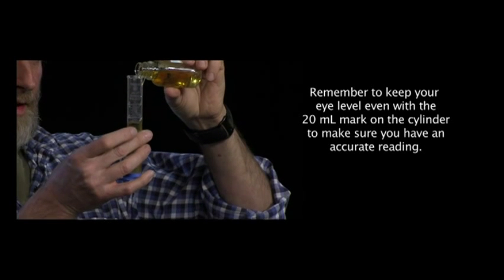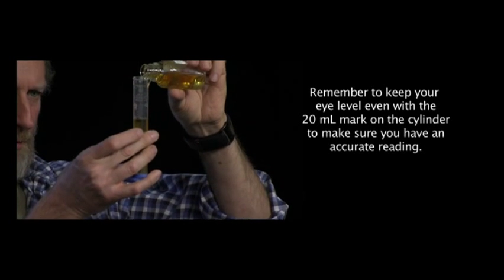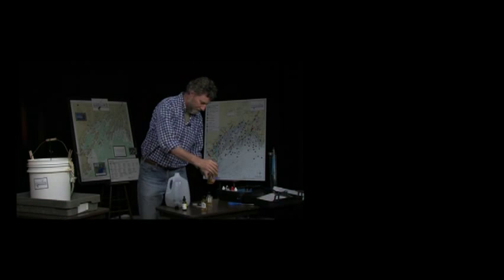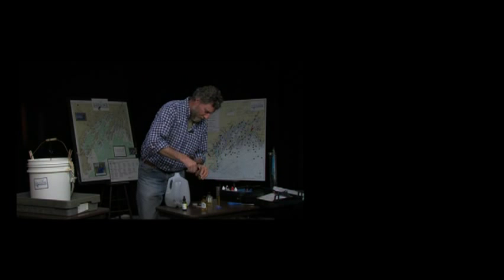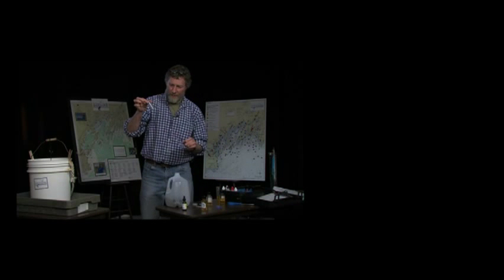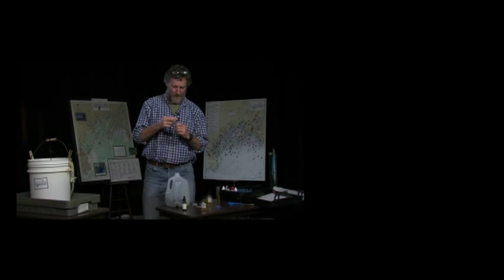So I'm going to do the same as I did before. I rinsed it 3 times. We'll fill it up to the 20 mil line. We'll set that aside. I'm going to take my titration tube again, and I'm going to fill that with my sample.